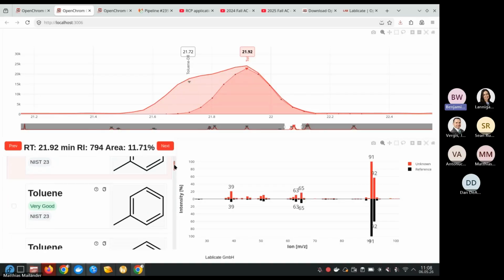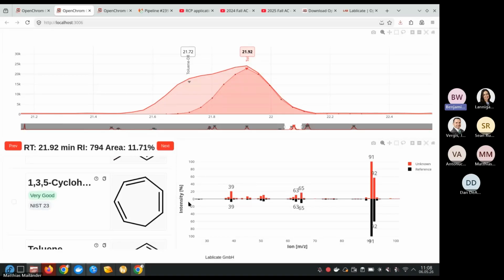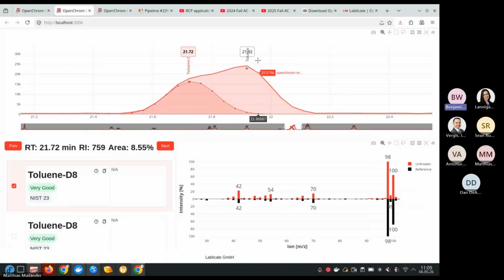Maybe they want to see everything, because they have a lot of domain knowledge. They know best, maybe even better than the analytical chemist, what's inside the sample. So maybe it's the fifth query here. Or another point is, actually, I said it the other way around: you have an external customer. They want to see the chromatogram, but they're actually not chemists, so they have no idea what this is about, what's toluene, and why is there a D8.